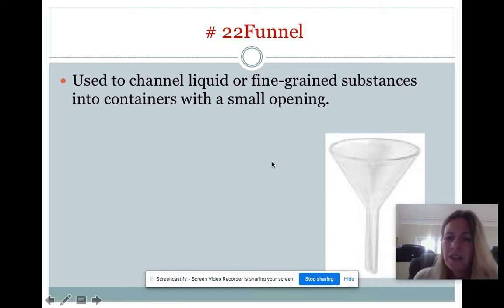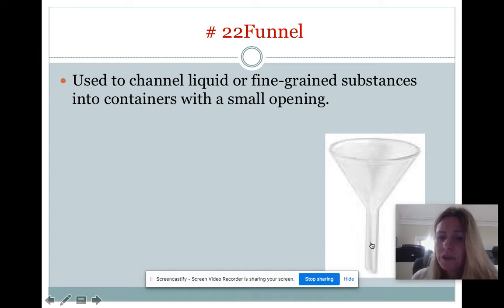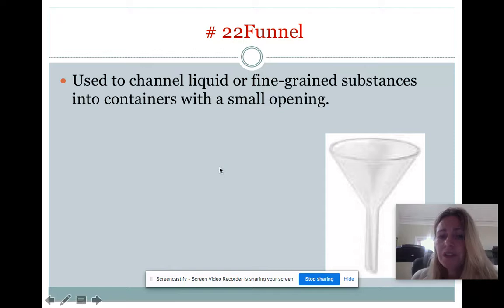That's really important in biology, because sometimes if you want the small stuff like proteins or DNA to flow through, we filter it out from the cellular components, like the cell membrane and thicker pieces of the cell, which remain on top if we want to look at the smaller pieces of cells. So we use funnels quite often.